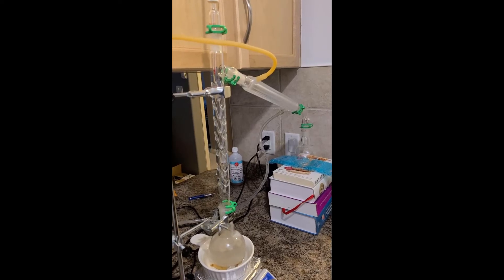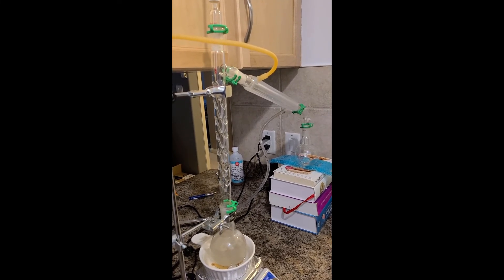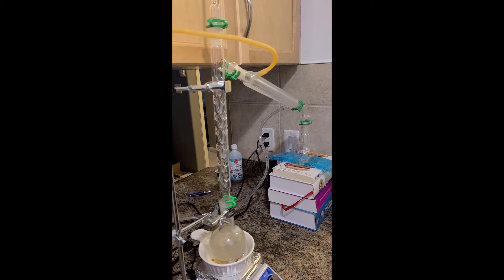I put the ingredients and a stir bar in a round bottom flask, topped it with a vigreux fractioning condenser, an elbow with thermometer attachment, a Liebig condenser, another elbow, and finally a receiver flask. I then started the cooling water, gentle hot plate heating, and stirring.